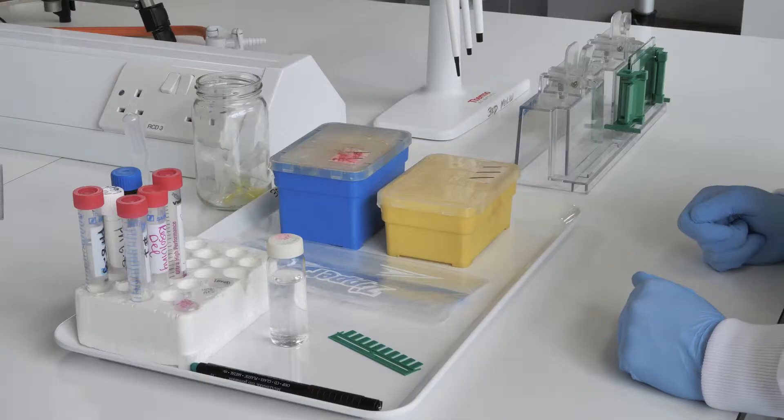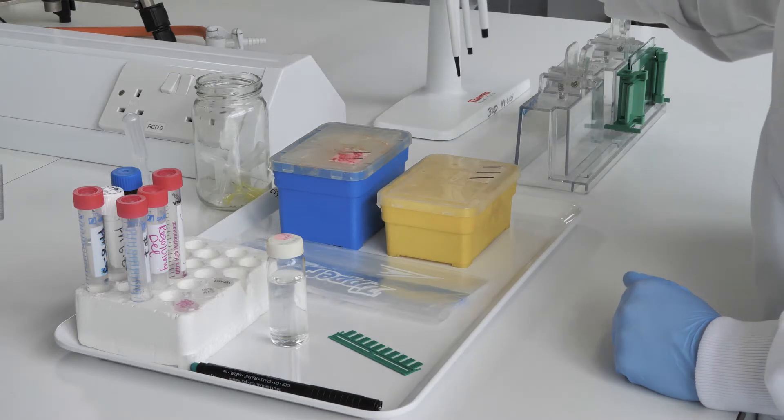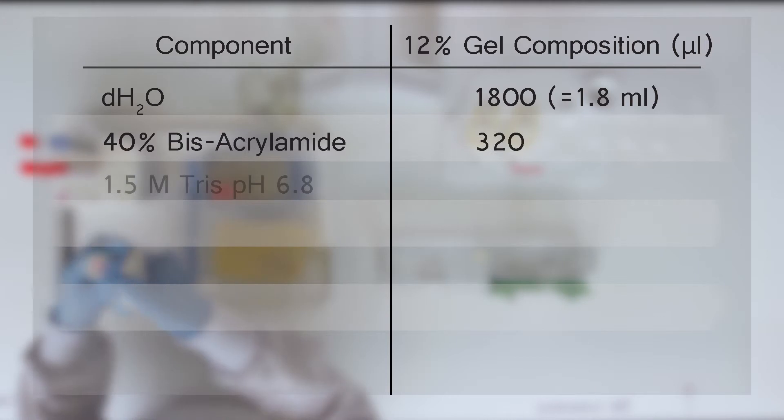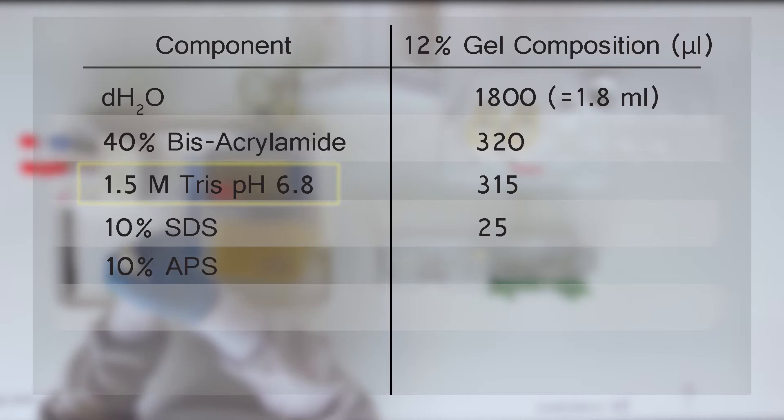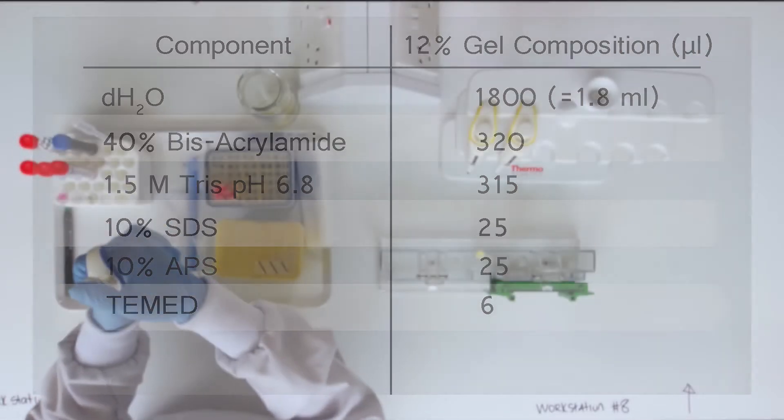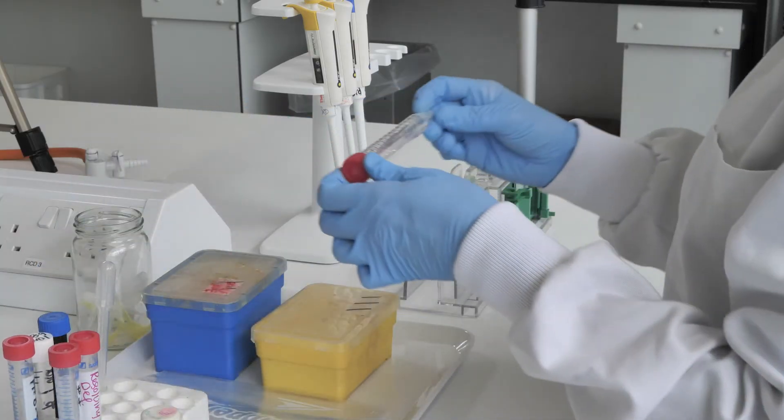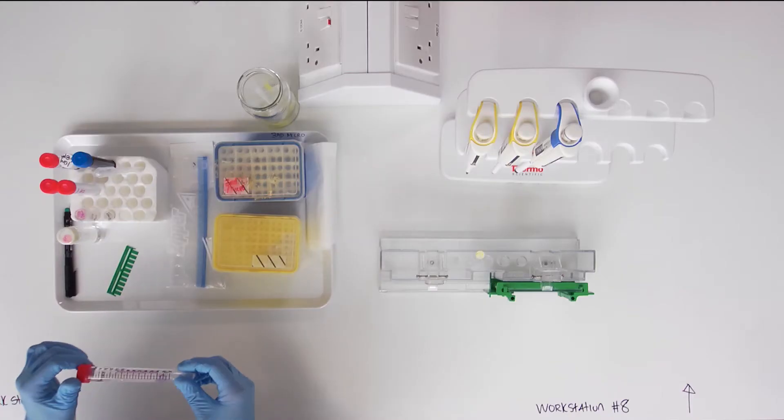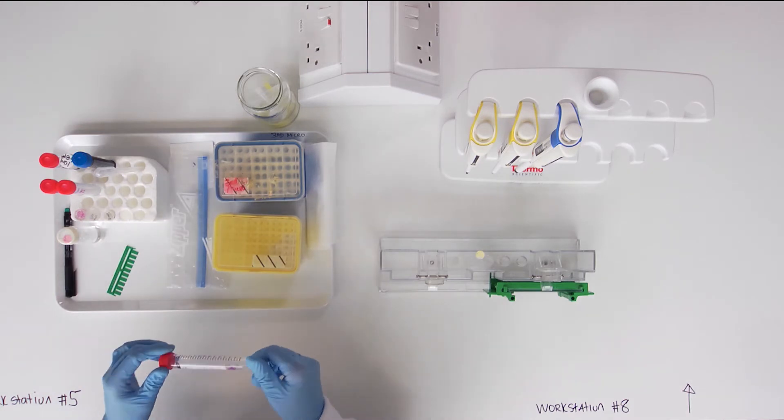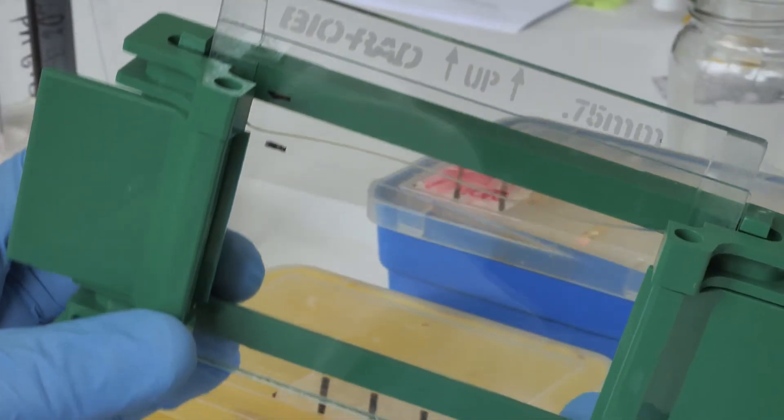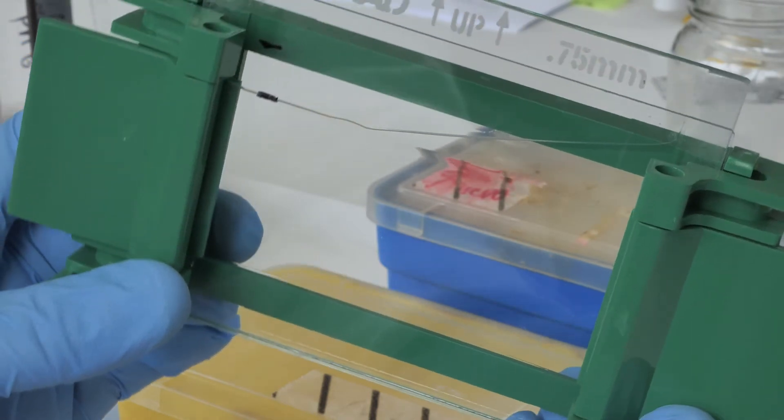While the resolving gel is polymerizing, which usually takes between 15 and 30 minutes, prepare the stacking gel solution according to the recipe shown. Again note the different Tris buffer to be used in this solution. Notice that the volumes are given in microliters. Do not add TEMED until the resolving gel has polymerized.